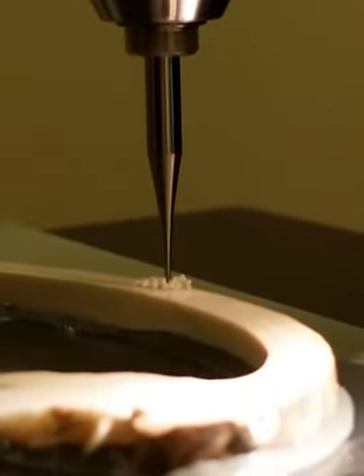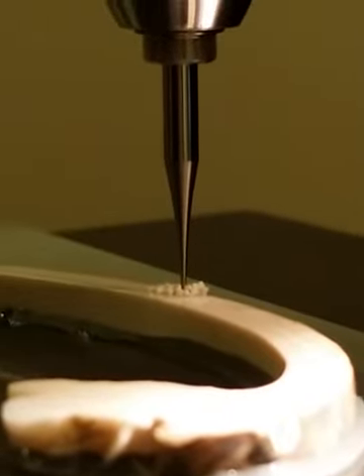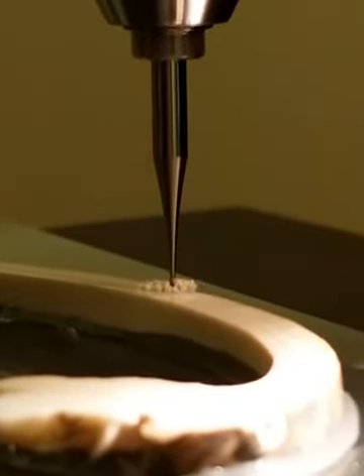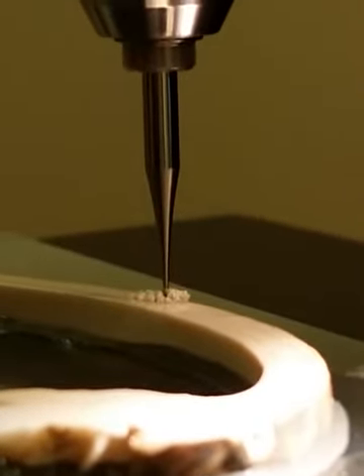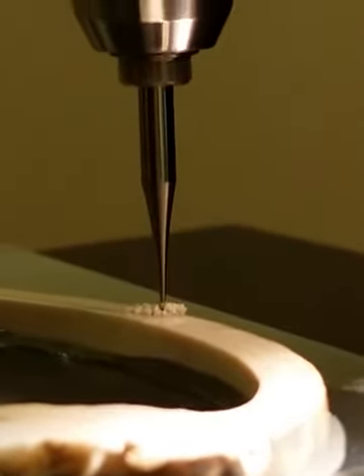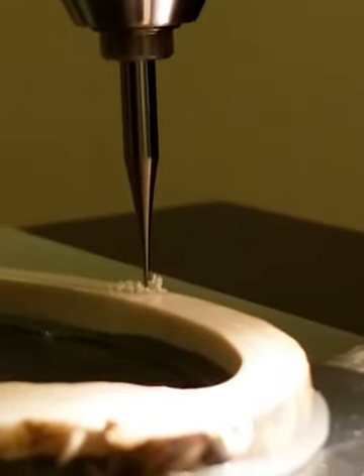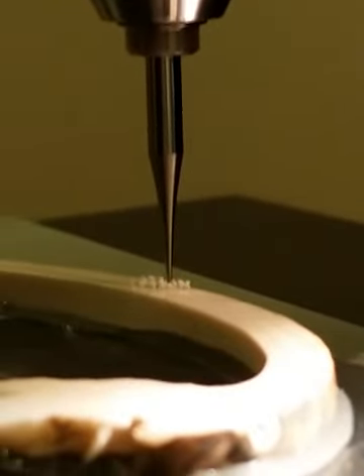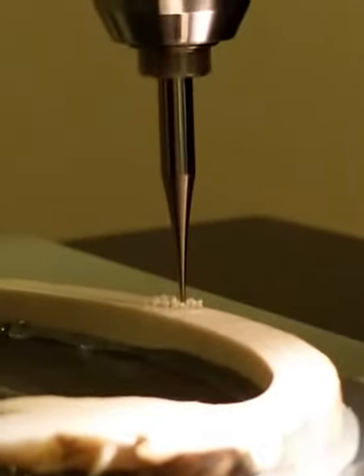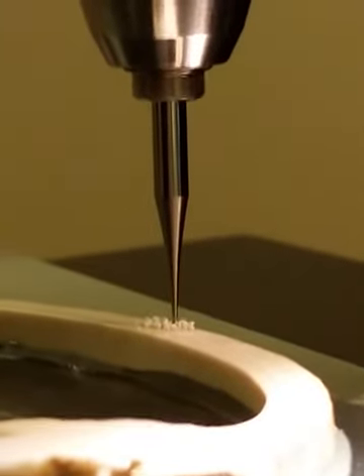And the thing you have to think about, depending on the bit that you're using, like this one, as you go down, we're at 750 deep, the shank starts to widen up a little bit. So it's going to start hitting the upper part of the trough that you're cutting. So you can't go real deep with these. Probably a couple of millimeters. You could probably go another 2 or 3 passes. But it starts already to get too deep. The friction's going to start affecting the sides. There we go.